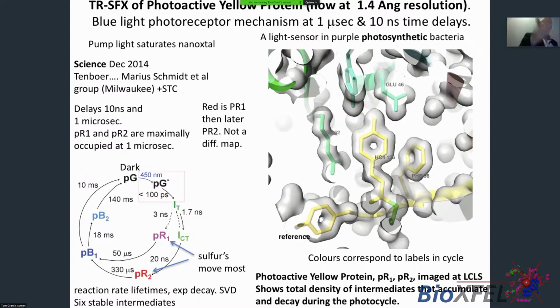That happens if you think about the rate equations, molecular dynamics. That happens very rarely and is extremely fast, this femtosecond transition. So what we see here are the amounts of the different species, and there will be several as a function of time. But we see this superimposed, the sum of those, in a spatial periodic average.